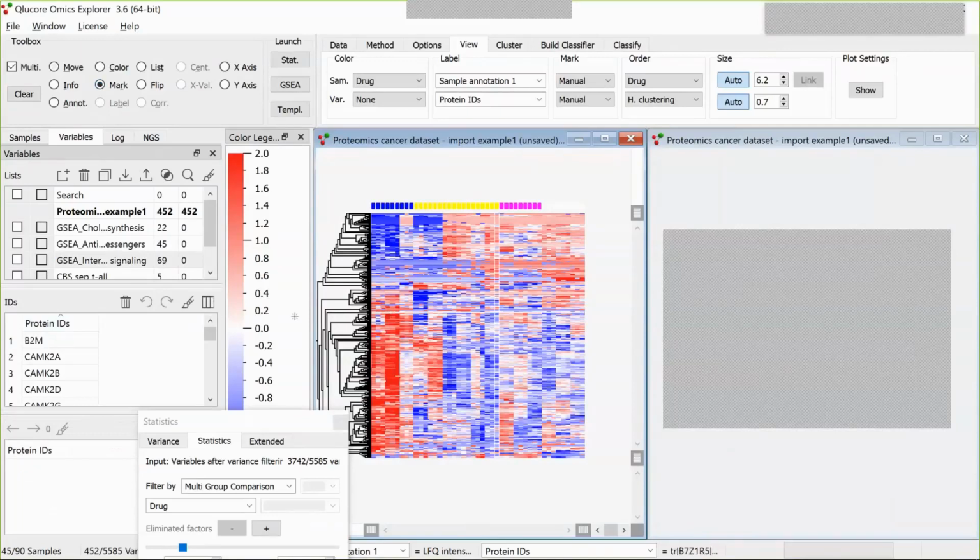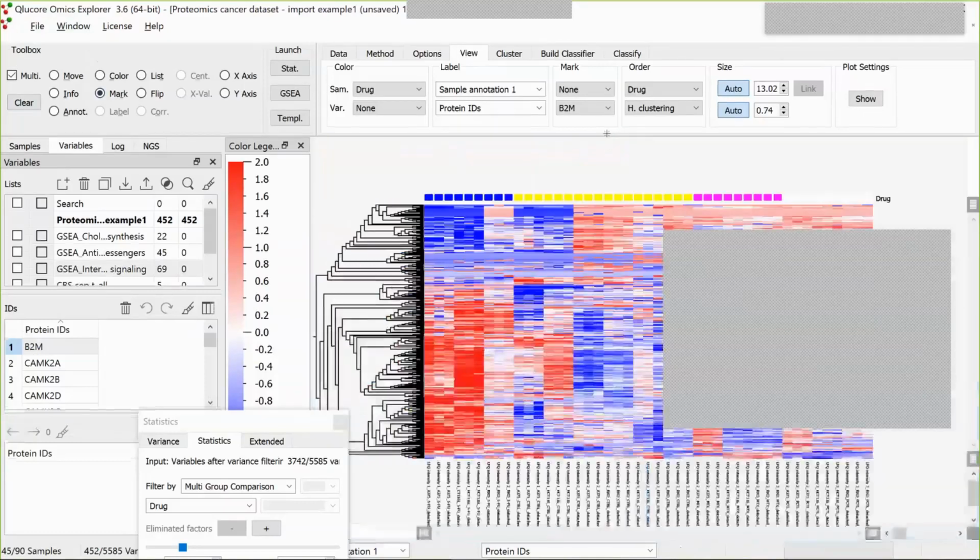So here, let's just see. Mark. At least that's how it should work. Let's do like that. Mark. Oh, I don't know why it doesn't do that.